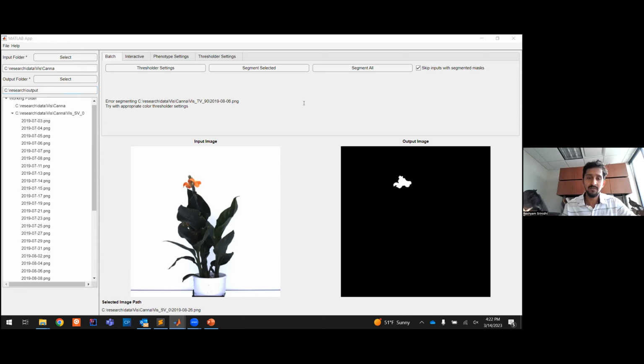I can see where it could fail, because based on the algorithm that runs in the background, it selects the biggest component. Most of the images have just one interesting object in the front, and the rest would be background. So currently that mode is meant to get that one plant.